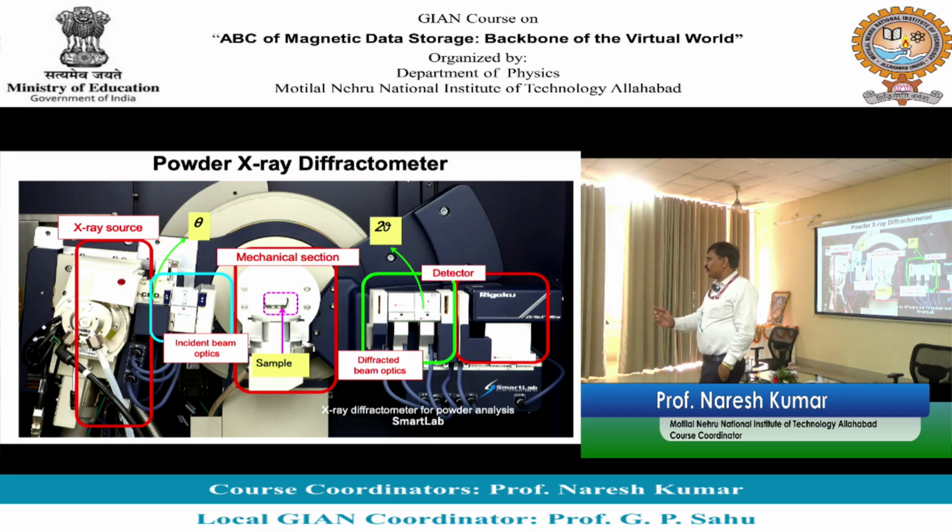So if you try to see the experiment, थीटा आएगी तो क्या मिलना चाहिए मुझे, एक्सपेरिमेंट में क्या दिखना चाहिए मुझे. If I am looking at just first order, what kind of data I should observe. यदि मैं थीटा वर्सेस इंटेंसिटी प्लॉट करूंगा, what do I see, पैटर्न में क्या दिखना चाहिए. एक सैंपल लिया जिसमें केवल एक ओरिएंटेशन है, right. X-ray is incident and I am talking about first order diffraction, n is equal to 1. So what do I observe if I plot theta versus intensity? What do I observe?